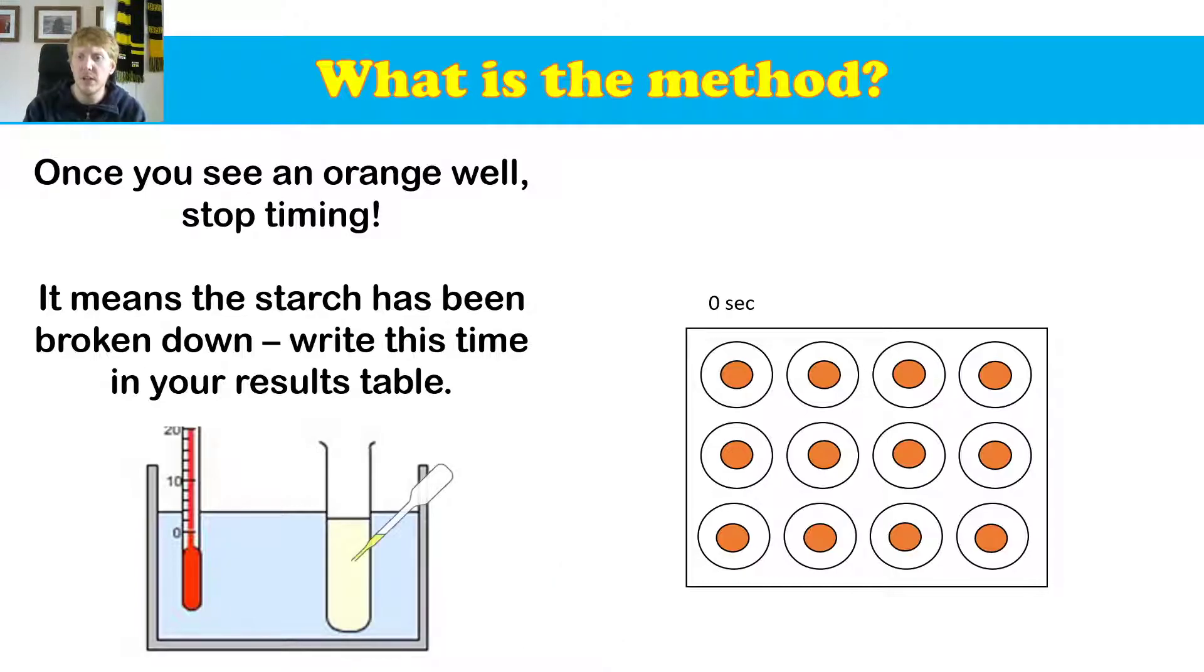And then what we are going to do is we are going to take one of our starch solution. We're going to put it on zero. And as you can see, it turned blue black, which means starch is present.